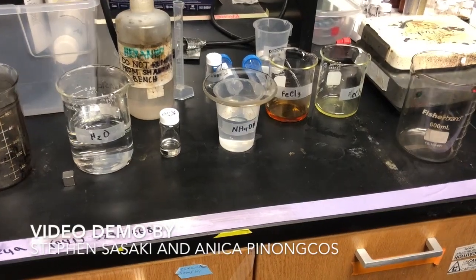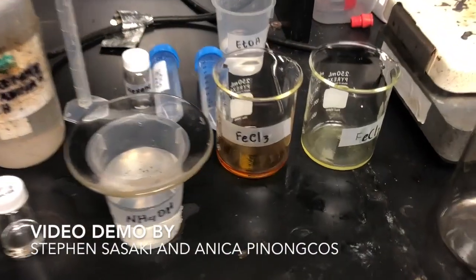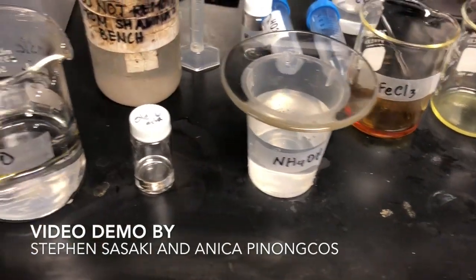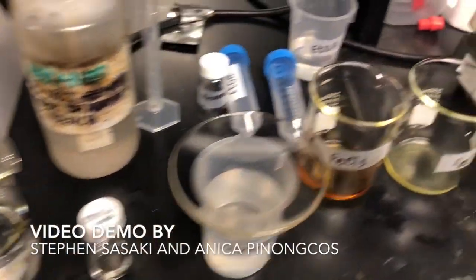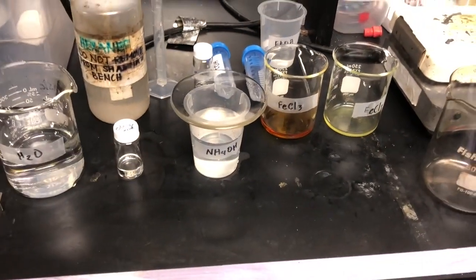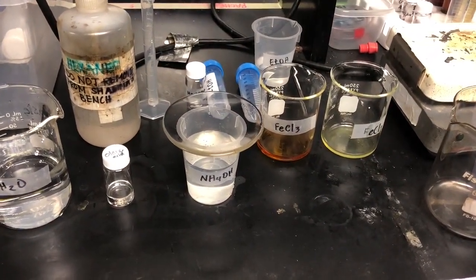We're going to start out with the Ferrofluids Demo. First, a quick review of our supplies. We have our iron chloride, we have our ammonium hydroxide, our oleic acid, our water, and our ethanol and hexane for washing.